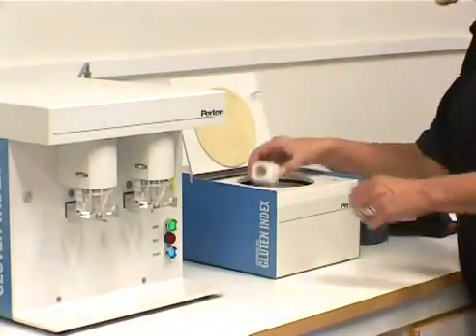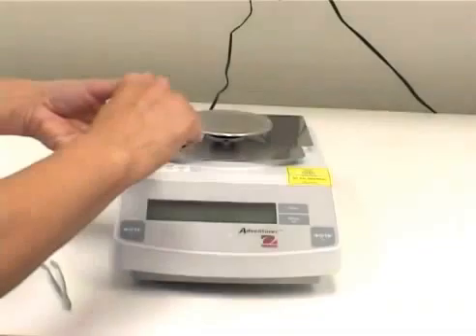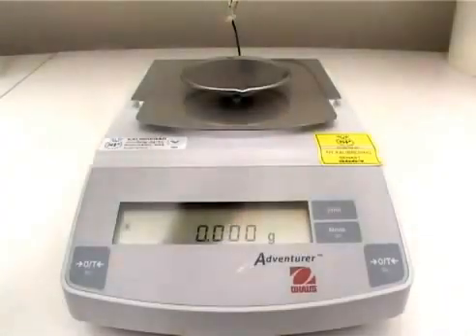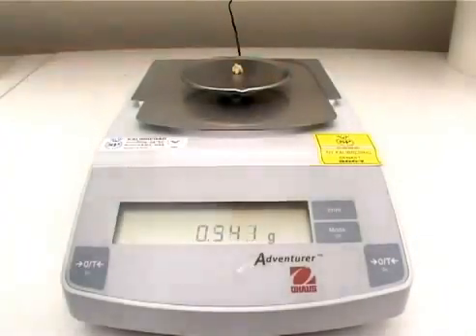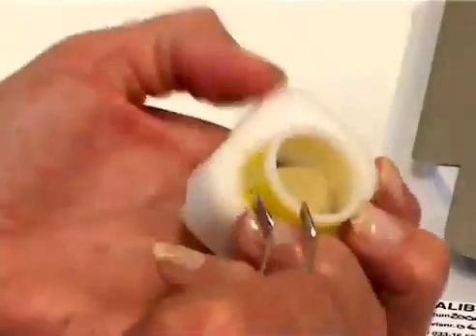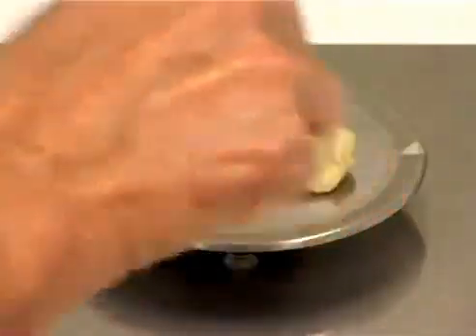Remove the cassettes. Carefully scrape out the through fraction on the sieve and weigh this. Remove the rest of the sample from the other side of the sieve and add this to the scale.